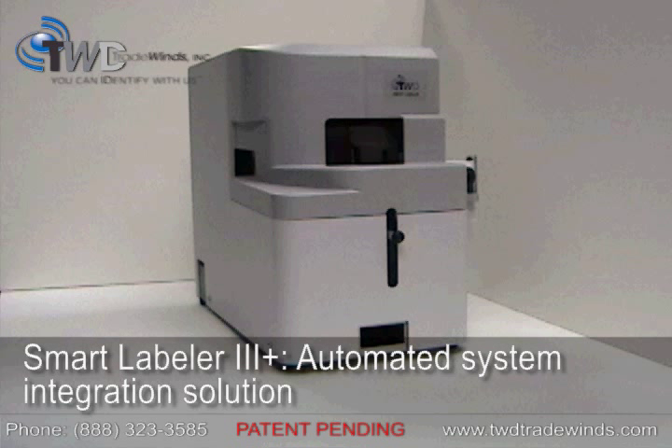For integration with other automated solutions such as liquid handlers, contact TWD to discuss options for the Smart Labeler 3 Plus model.